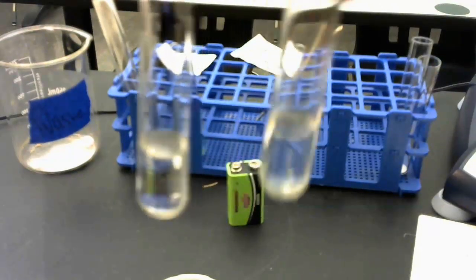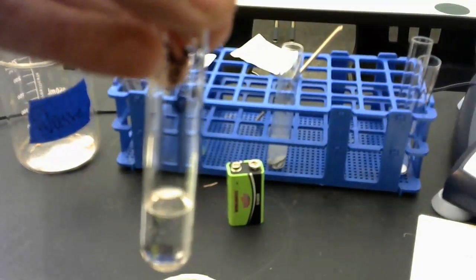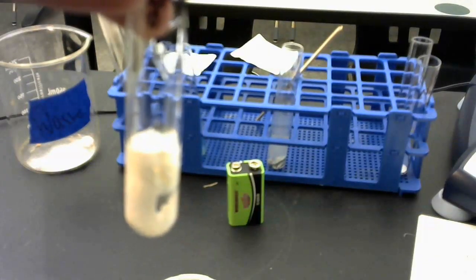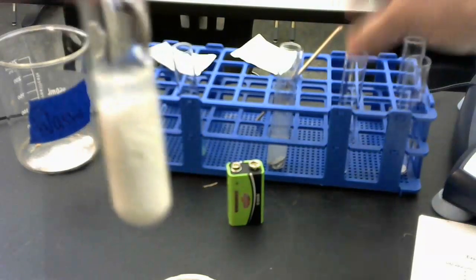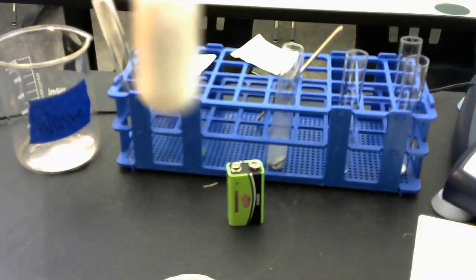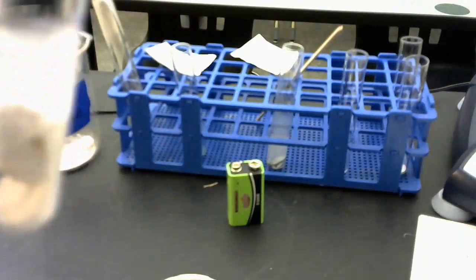Now what I'm going to do is pour those two together. I'm going to add the CaCl2 to my AgNO3. And as I do that, did you see what happened? Okay. I'm sure you can see that. And if you can't, I'm going to use a more brown background so you can see. Okay. That is a white powdery substance that has been produced.